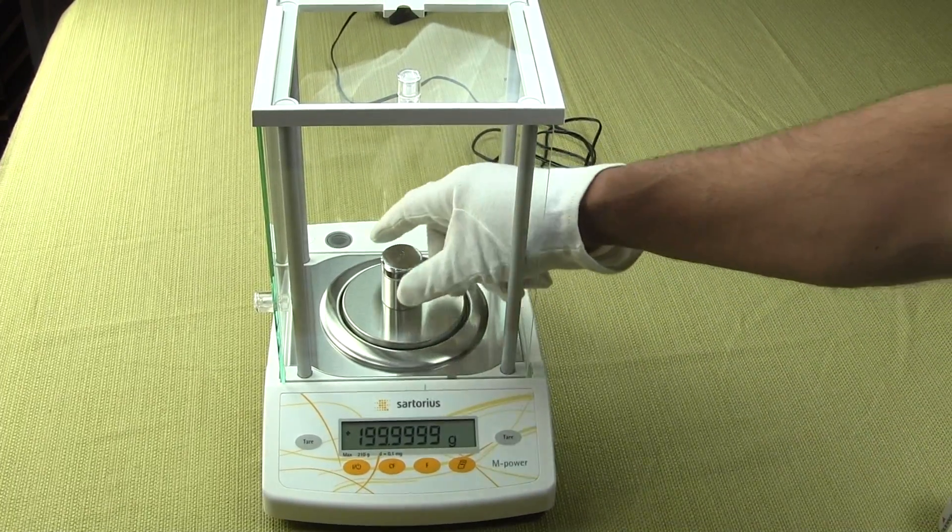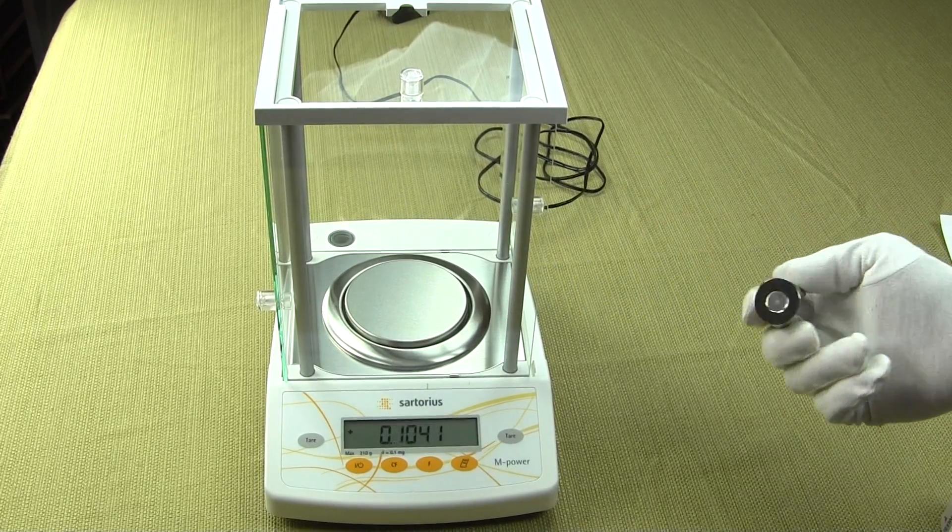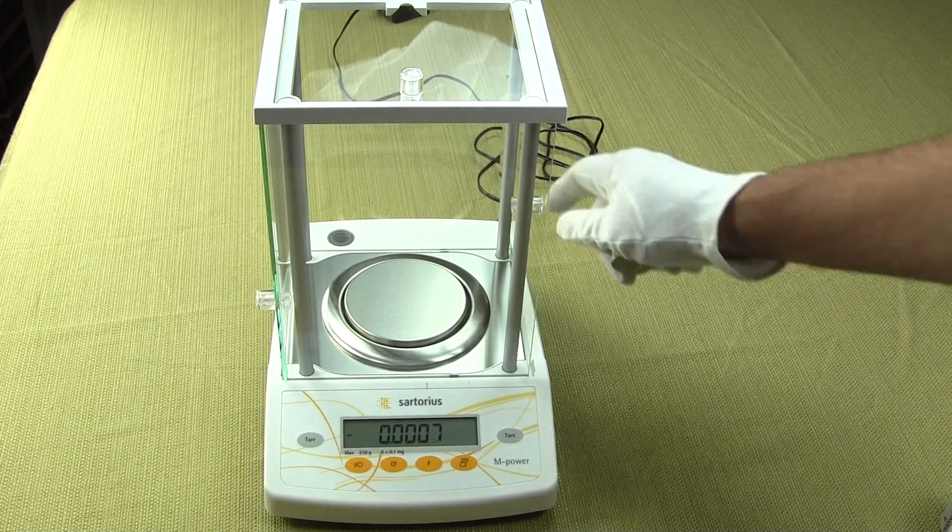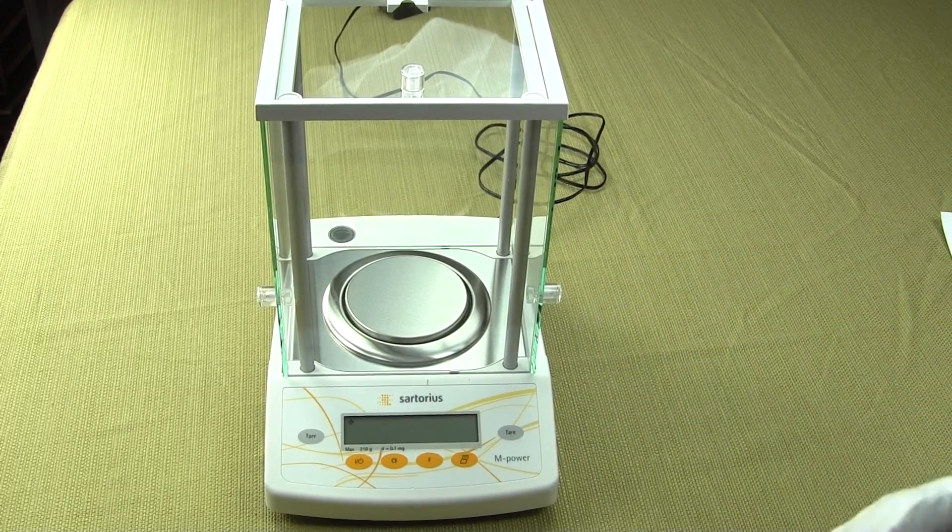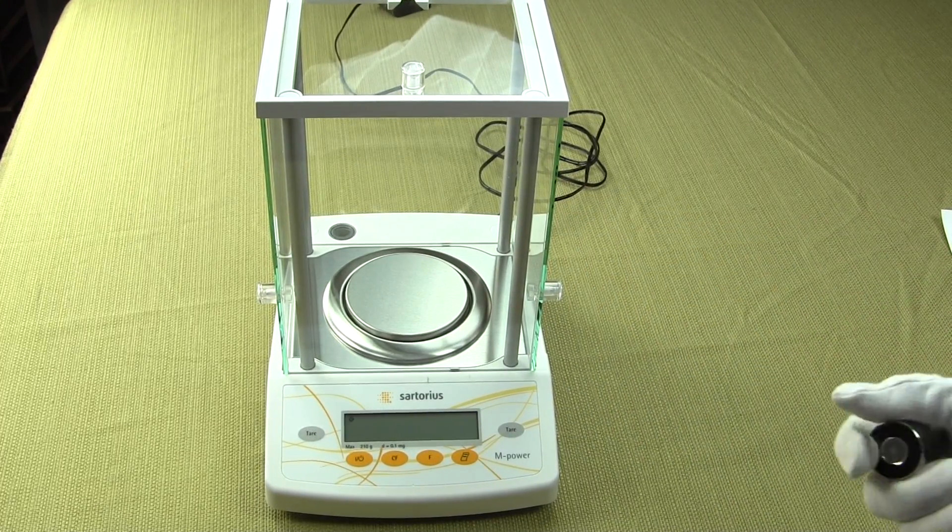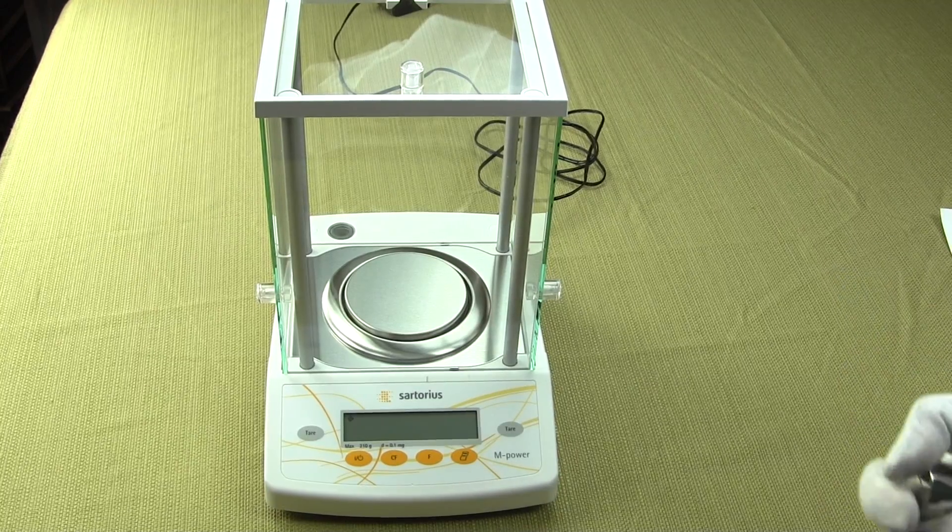You can see we have here a 200 gram class 1 calibration weight. To perform calibration is extremely simple. You first want the balance warmed up for at least 30 minutes, and this balance has been warmed up.